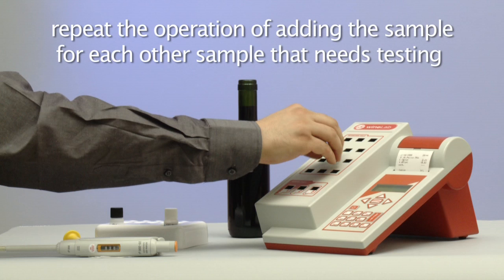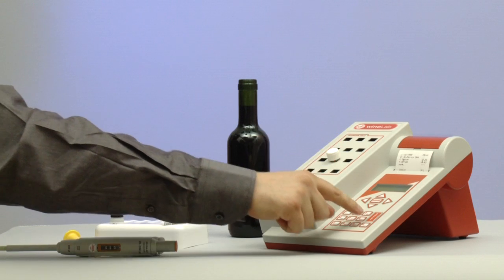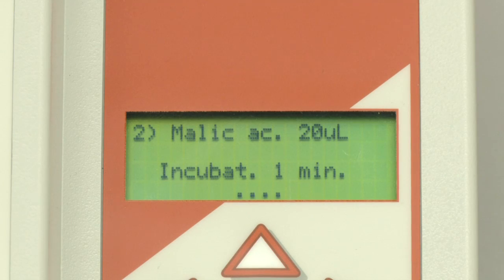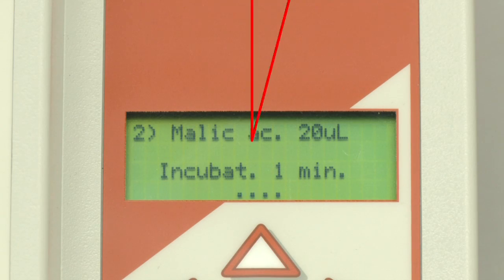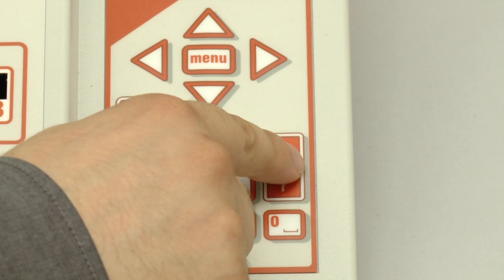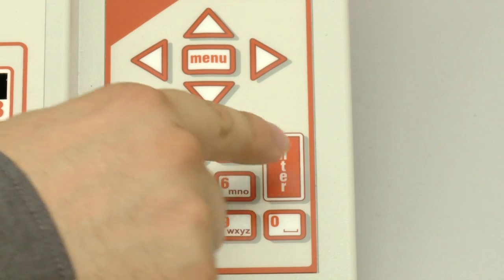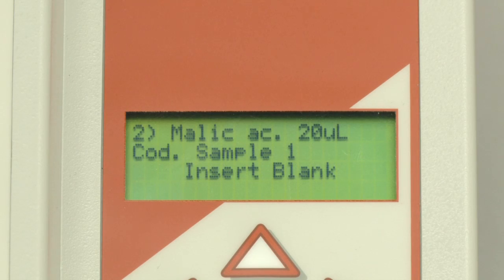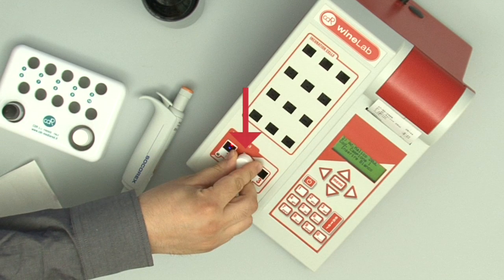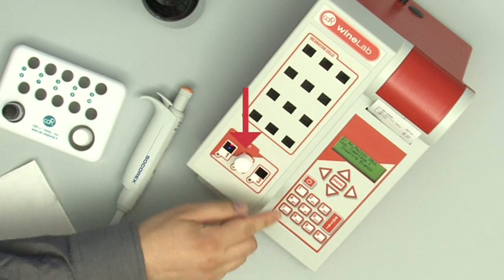Gently shake the test tube three to four times by inversion and place it again in the incubation cell. Repeat the operation of adding the sample for each other sample that needs testing. Then press Enter to start the incubation. Upon completion of incubation, press Enter. Insert blank displays. Place the test tube in the reading cell marked with the green light.